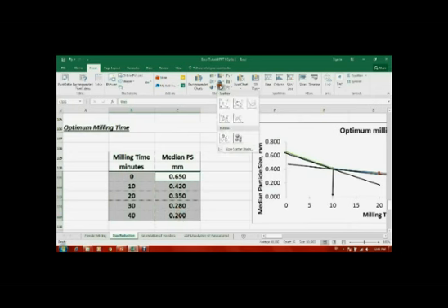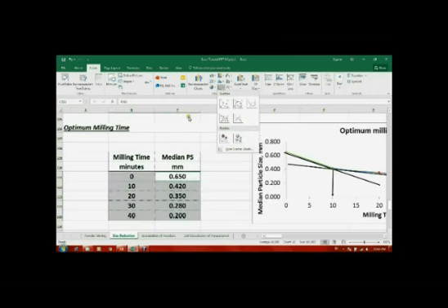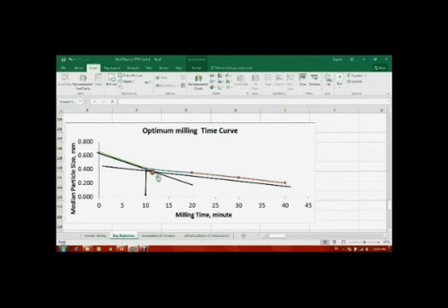Here we have only to change the gross weight, which will be the gross weights generated at 10 minutes. Accordingly, and if we are using the Excel equations correctly, everything will change. Having done so, now we will have the data, the median particle size at each time.